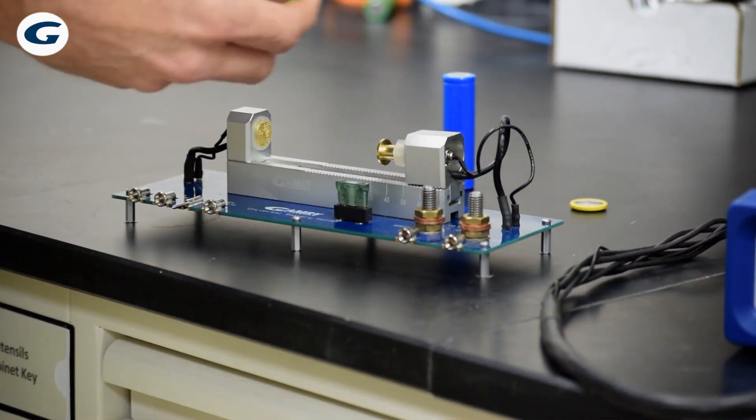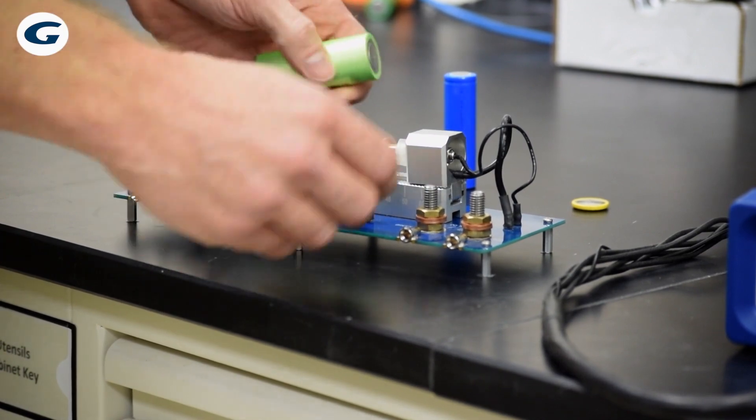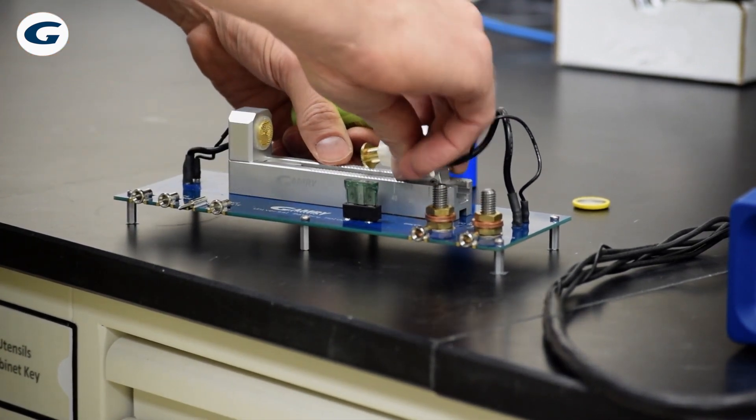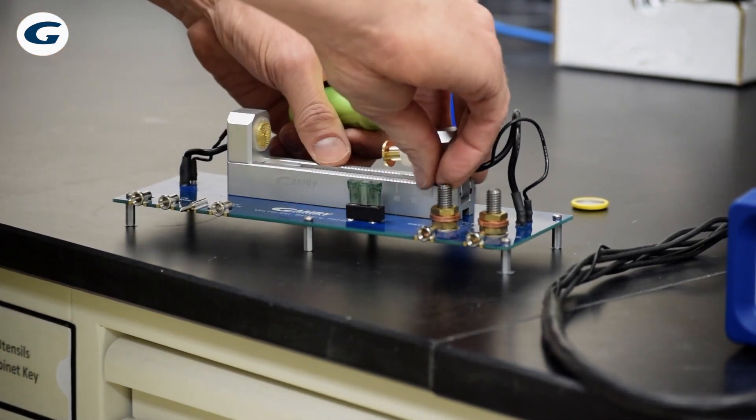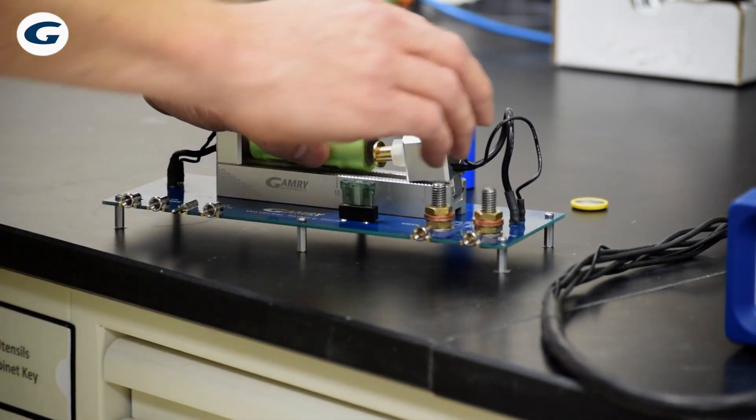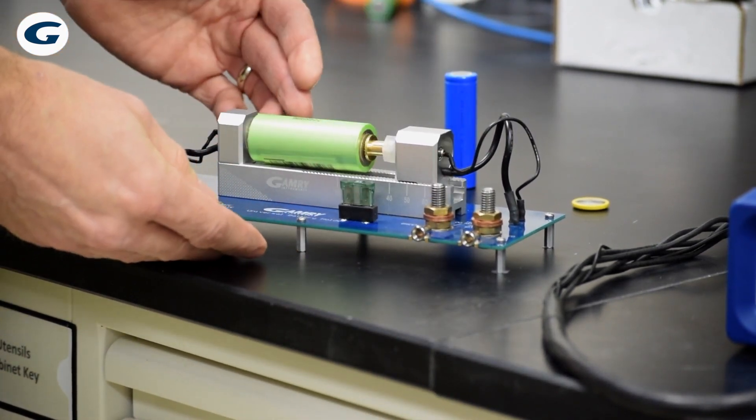We can mount any of these cells into the Universal Battery Holder by tilting this slider a little bit and sliding it forward or backward. We hold the cell in here, slide it forward and now it's mounted.